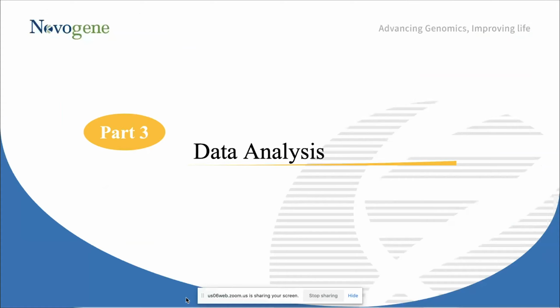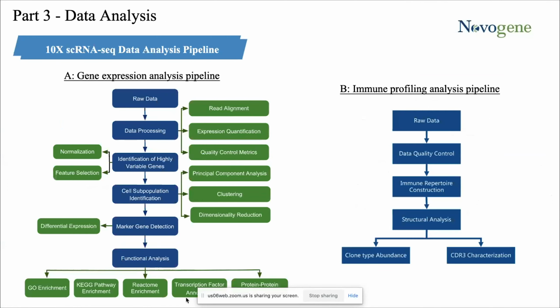In part 3, I would like to show you our data analysis pipeline for single-cell gene expression. For data analysis, we use Cell Ranger from 10x Genomics. Shown on the left of the slide is our gene expression analysis pipeline.